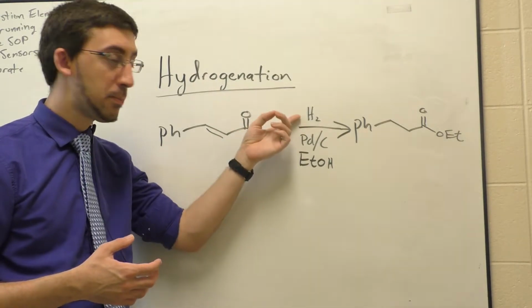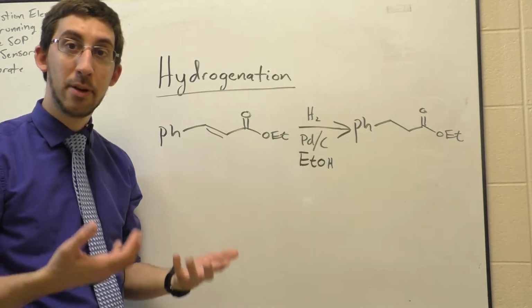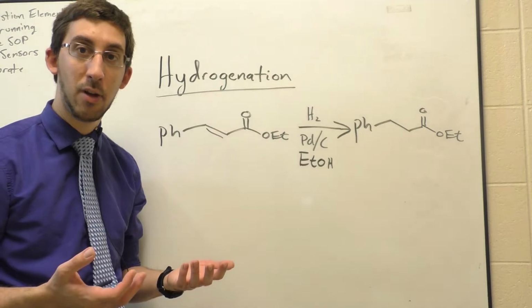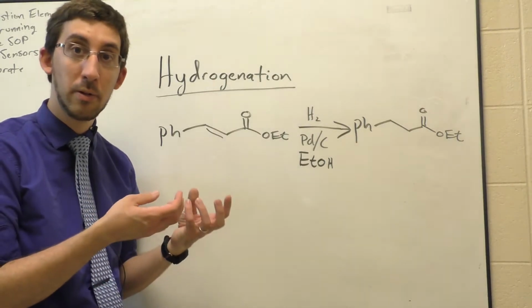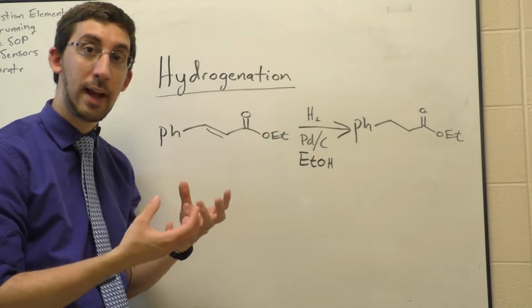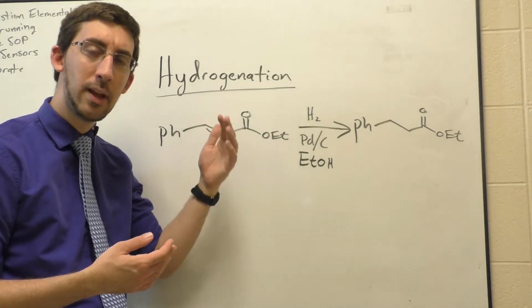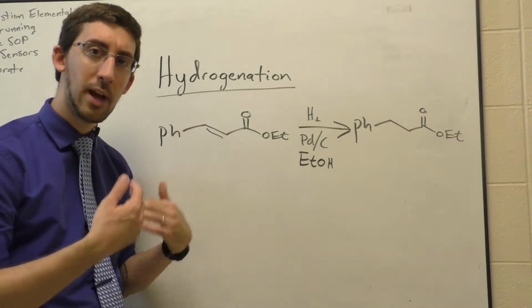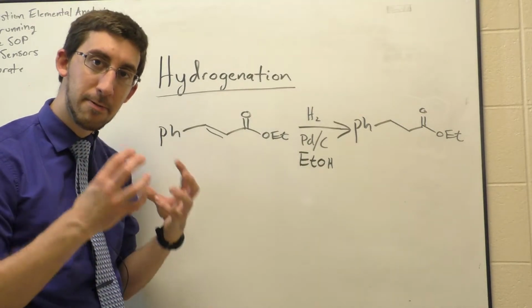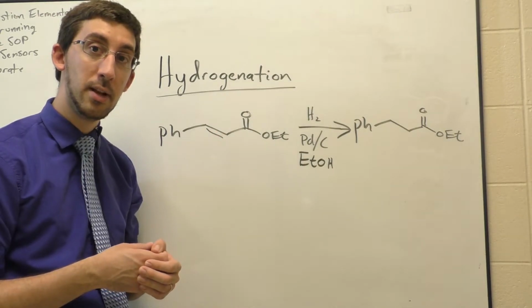In terms of hydrogen pressure, we don't need a special apparatus most of the time. We don't need high pressures of hydrogen. Most of the time, all we need is 1 atmosphere of hydrogen, which equates to simply filling up a balloon of hydrogen and purging the atmosphere of our reaction vessel with H2, just to get rid of any air. Hydrogen is lighter than air, and so it's helpful to purge out oxygen and nitrogen from the atmosphere and saturate it with H2, and then we can simply let the reaction proceed.